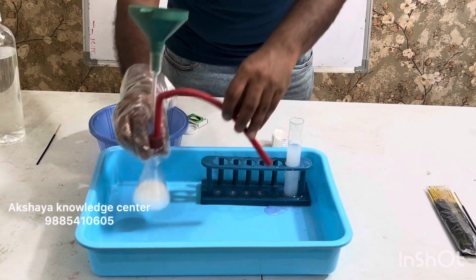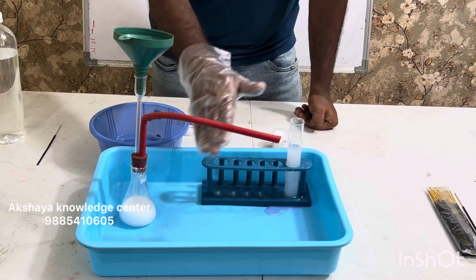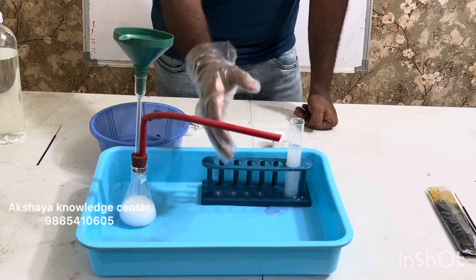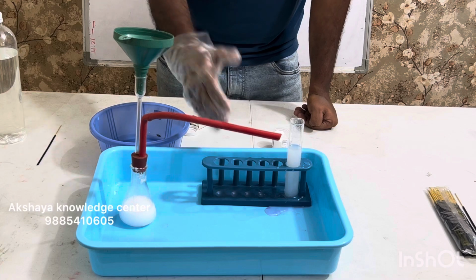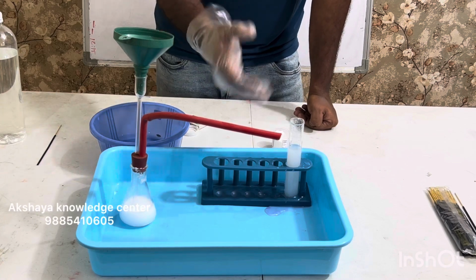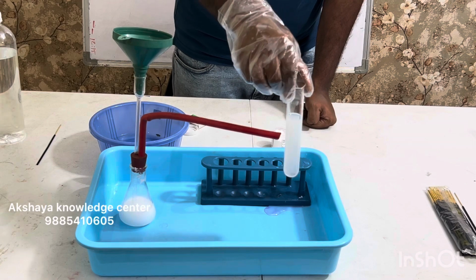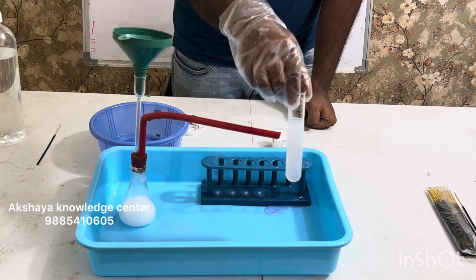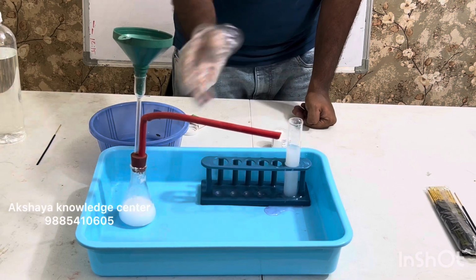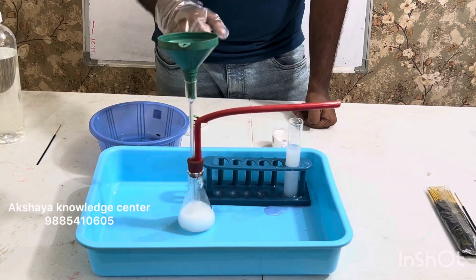I'm removing the pipe carefully. So kids, when they are doing this experiment, they have to use a tray because there might be spillage, and I don't want any chemicals to fall on their body or clothes. So please look at this. Lime water is turning to milk white color. This proves that the gas that came out of this conical flask during the experiment is carbon dioxide.